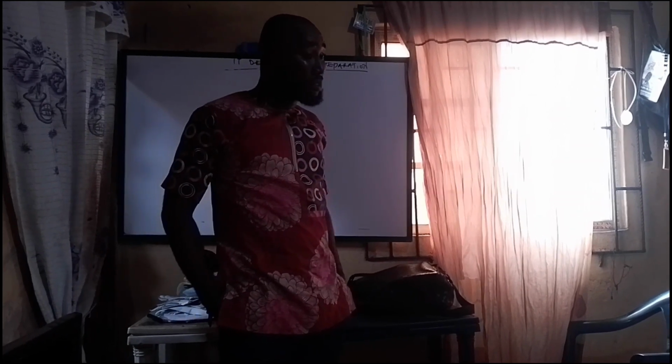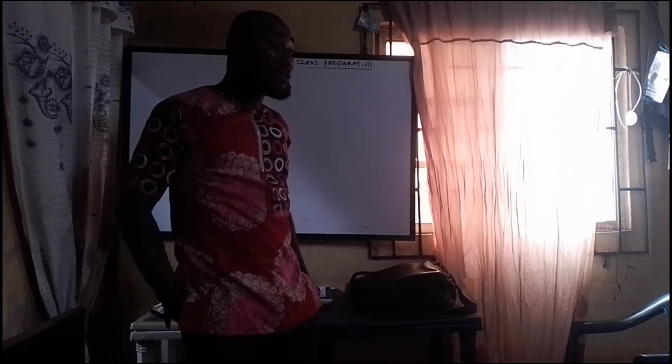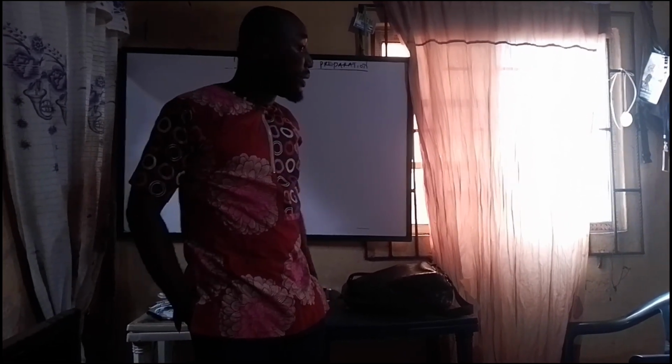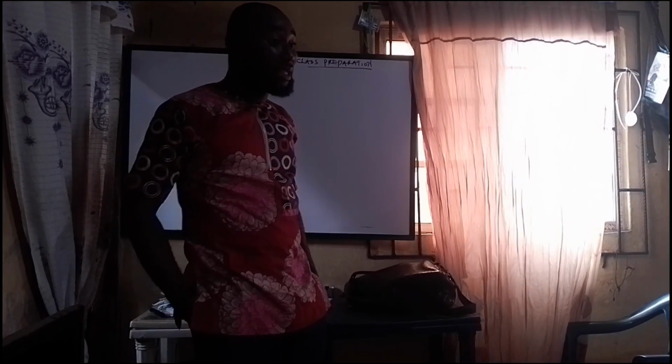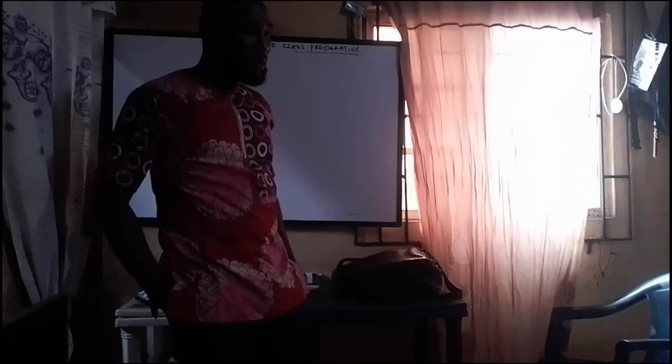The problem with the autoclave is you need NEPA lights. Without light, you can't use the autoclave. The generator cannot carry it. That generator cannot power the autoclave. It will just damage the generator. So there must be steady light. But thankfully, we have been having light in the lab this period. I don't know if you have experienced that.